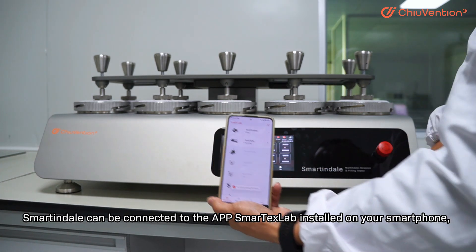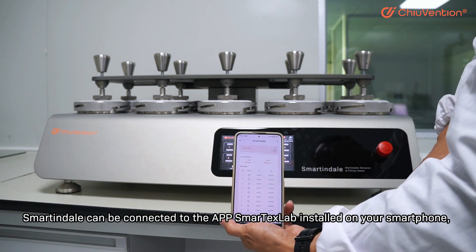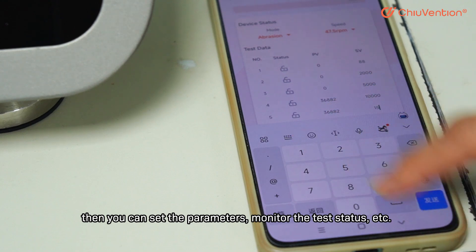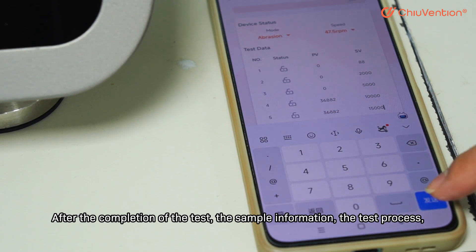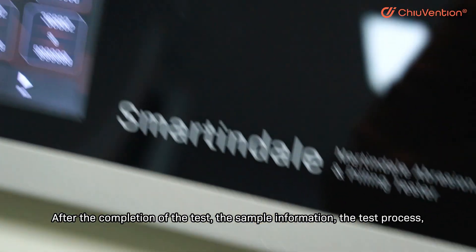Smartindale can be connected to the app Smartex Lab, installed on your smartphone. You can then set the parameters and monitor the test status. After the completion of the test, the sample information, the test process, and the results can be uploaded.